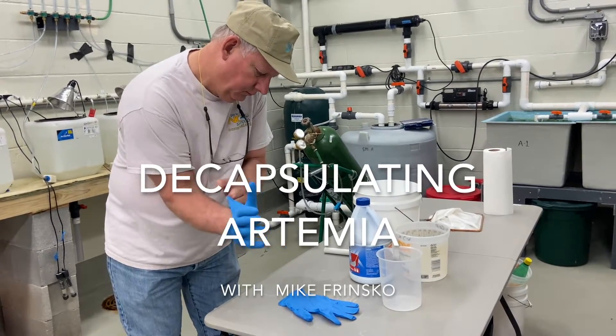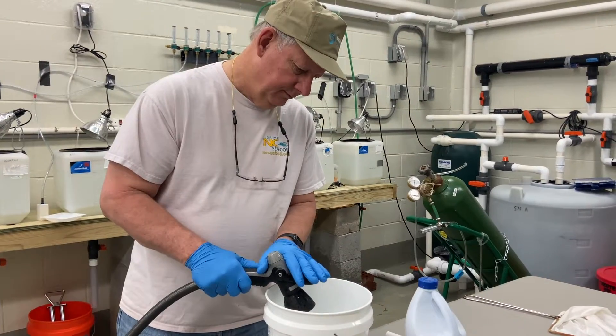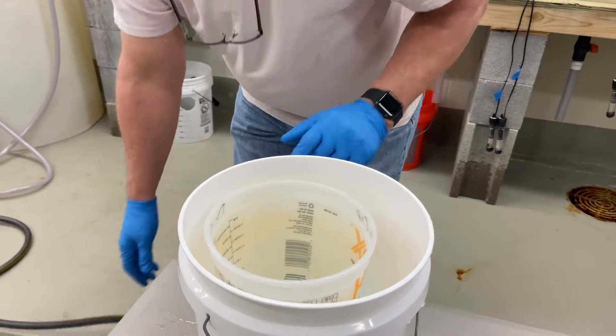Mike is getting ready to decapsulate the artemia — the process of chemically removing the outer shell of the artemia cyst, leaving only the embryo surrounded by the chorionic membrane.